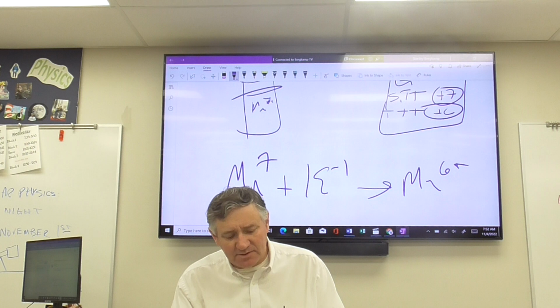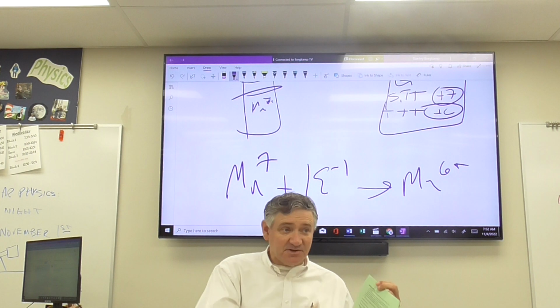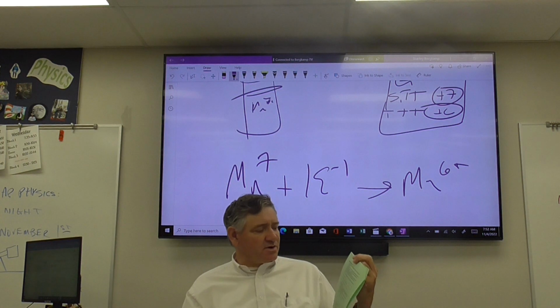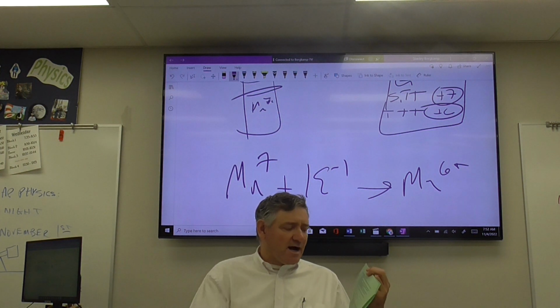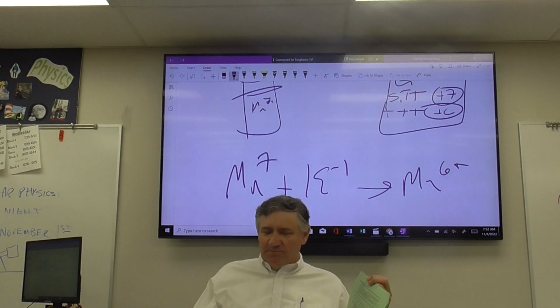Now we need to move over to step 3. Now we're going to try and make Mn5+. So now we're going in steps. Now you're going to measure out about 2 grams of potassium hydroxide pellets.